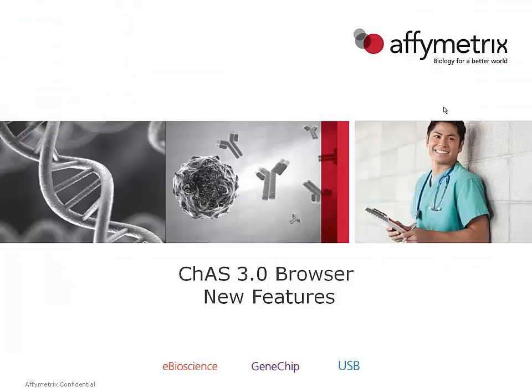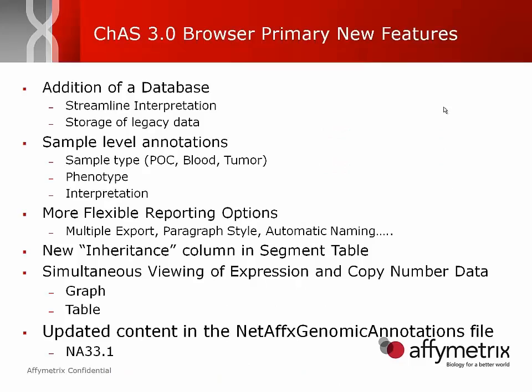Now let's move over to the other module, the browser. So the primary new features that we're going to run through are the addition of this database. This is to help streamline interpretation. If I'm looking at my current sample of the day, it will allow me to view the segments and see if I've ever seen them before in my database. If so, what did I call them? Did I have any phenotype information with them? It's just a way to streamline interpretation to help put annotation to my current sample. And it also gives me a place to store legacy data.